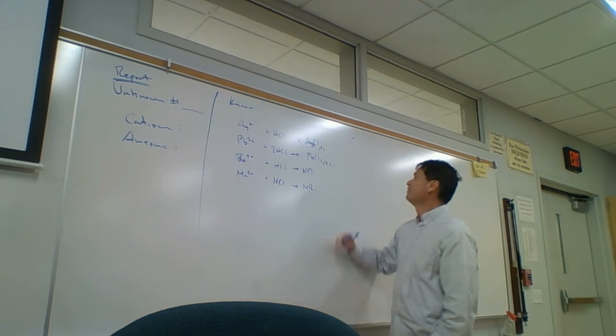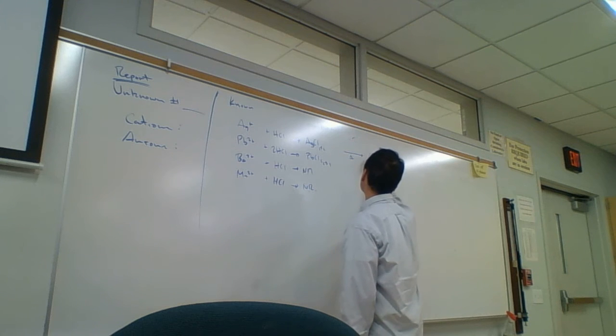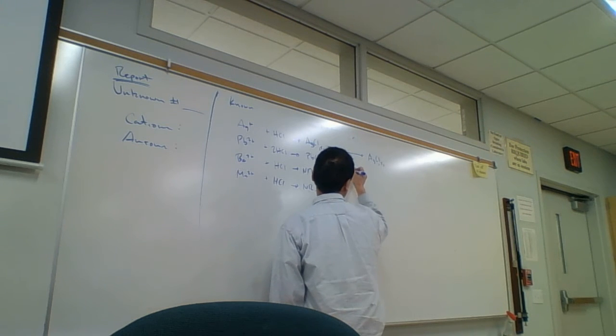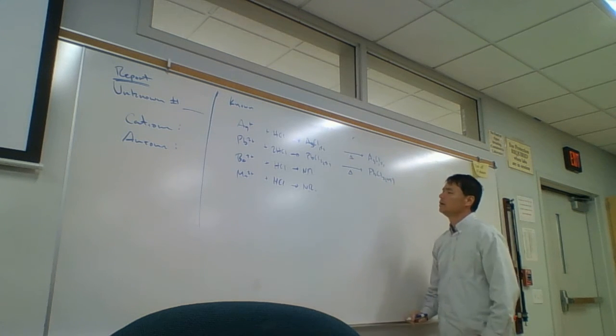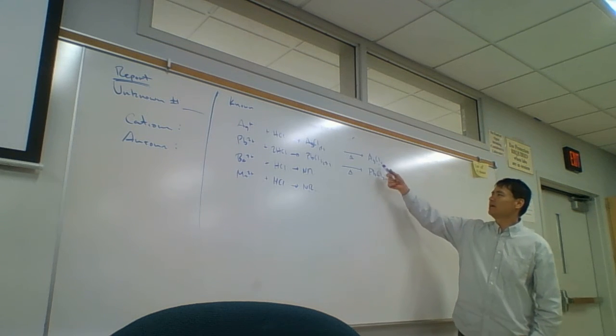Okay, in the next step, we heat this. When we heat silver chloride mixed with water, nothing happens pretty much. It stays a precipitate. However, when we heat the lead, the lead dissolves. So we'll get PbCl2 aqueous. So that dissolves that, and we've isolated the silver chloride.